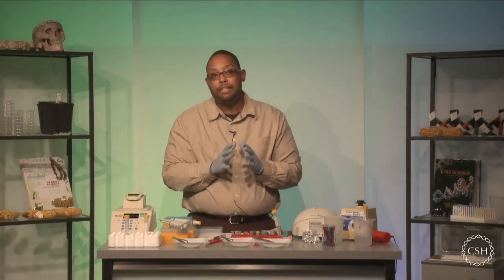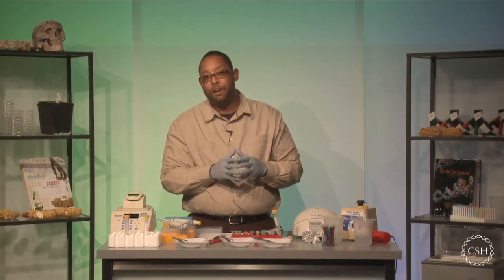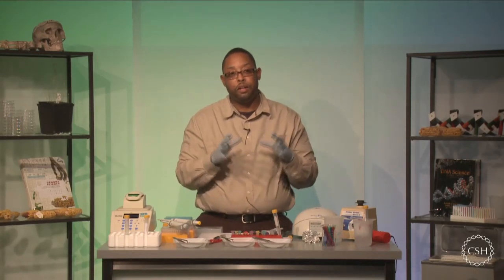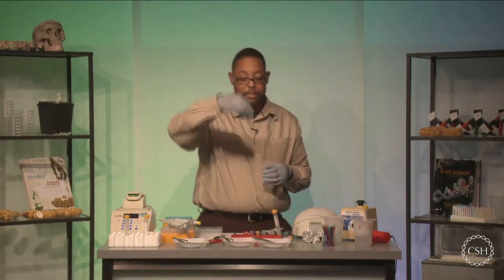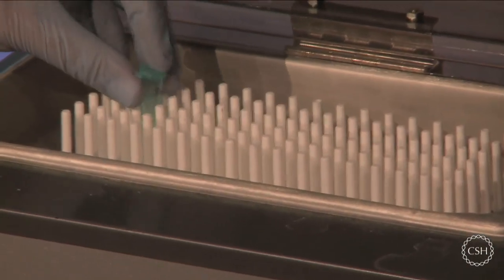Now, at this time, you're going to actually put your samples into incubate at 65 degrees Celsius for about 10 minutes. This is going to allow further lysis of all the membranous material so that we can extract more DNA. So I'm going to take my samples at this time and put them into my water bath.